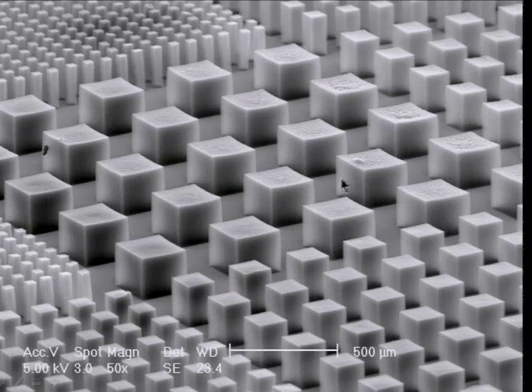Because the electron beam is scanning over this back and forth, and the sample is thinner over here, it looks lighter than it does over here where it's thicker. And if this weren't electrically conductive, but the carbon nanotubes are electrically conductive, the picture would very quickly blur out and disappear. That's where you would need to coat it with a conducting material to make the imaging technique work. And so this is a fairly low resolution image using an SEM.